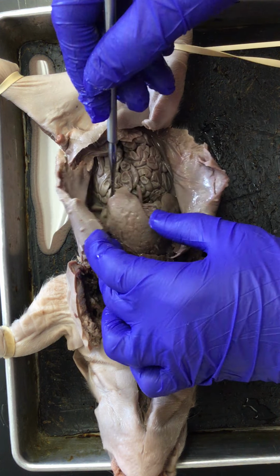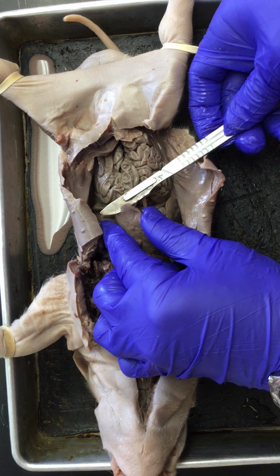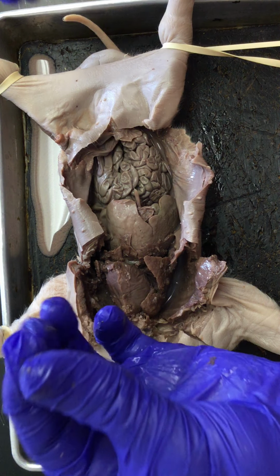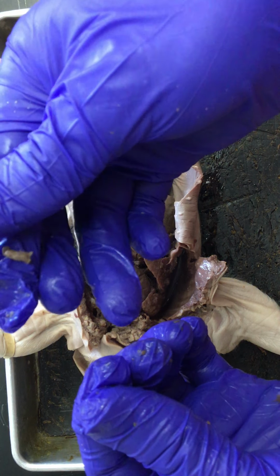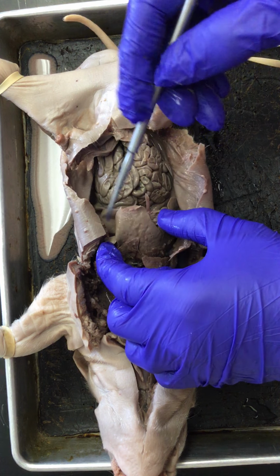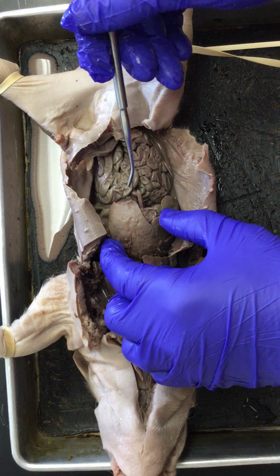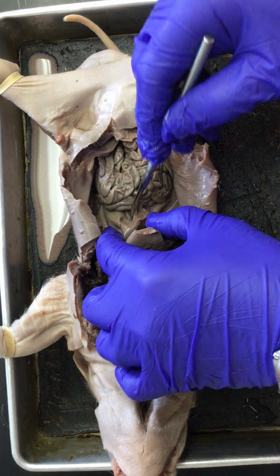Liver is a particularly grainy organ, so you have to be really careful when you're dissecting to not destroy it. We're obviously just going to cut a little piece of a lobe off. And then if I rub it in my fingers for a second, I can feel that it's really grainy, like it almost feels like sand as I rub it in my fingers. And so the liver, particularly grainy, really hyper-regenerative organ. You can slice off some of your liver and donate it, and that liver will regrow itself to the point where it's perfectly functional for you and another person. So you can take an entire lobe of a liver and donate it if a person needs a liver.